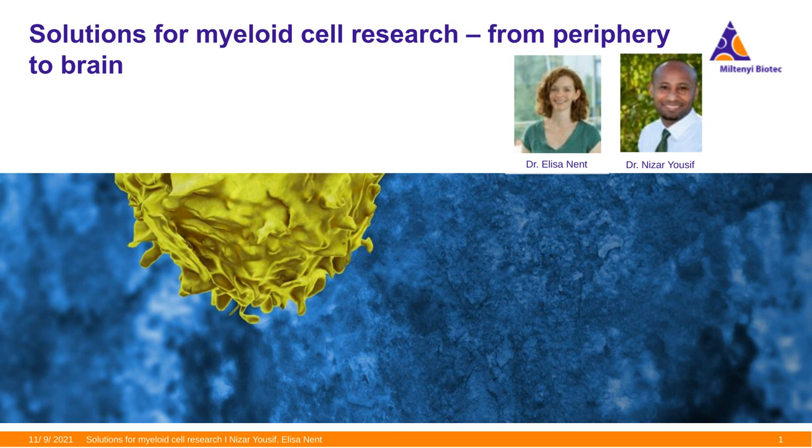You presented straight from products for the isolation of cells from human blood sources. Do you have straight from solutions for the isolation of cells from mouse tumor tissue? This is actually very interesting, a very nice question. No, we don't have straight from solutions for mouse tumor tissues yet. However, we are working on mouse tissue straight from solutions, for example, for the isolation of myeloid cells from mouse spleen. So please stay tuned. Great, thank you. Next question.